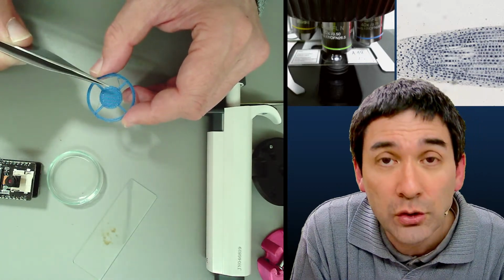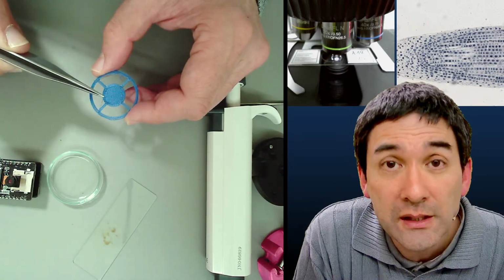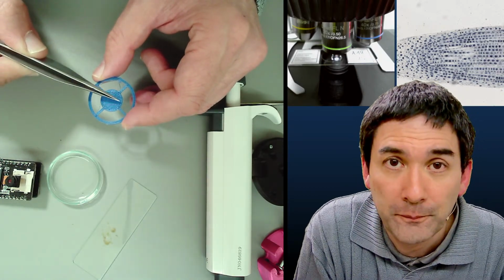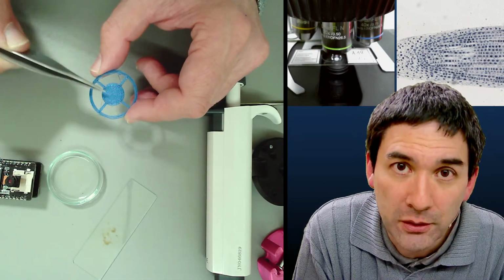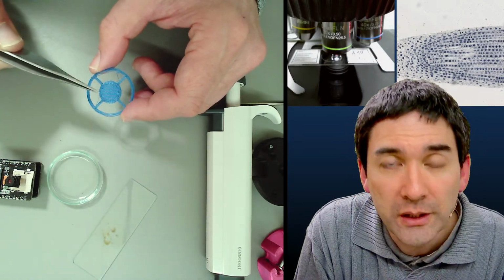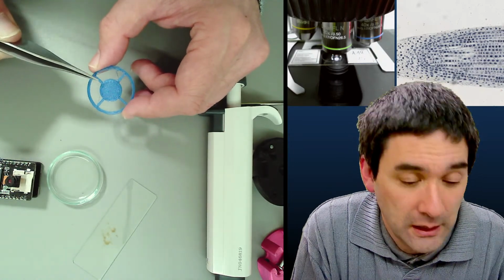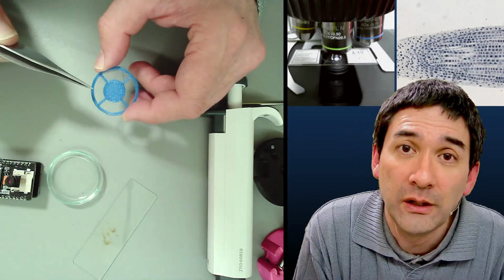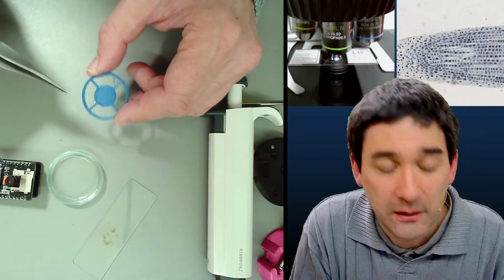So generally, try to get it to work with 10 times. And if the background is not completely dark, then you have to make this disc larger. If you're not sure, just make it a little bit larger. It's better to err on the larger size, okay? Then the background is going to be a little bit darker, but there still should be enough light from the side. And you have to completely open the condenser, and you have to raise the condenser all the way to the top. Okay, and then it should work.